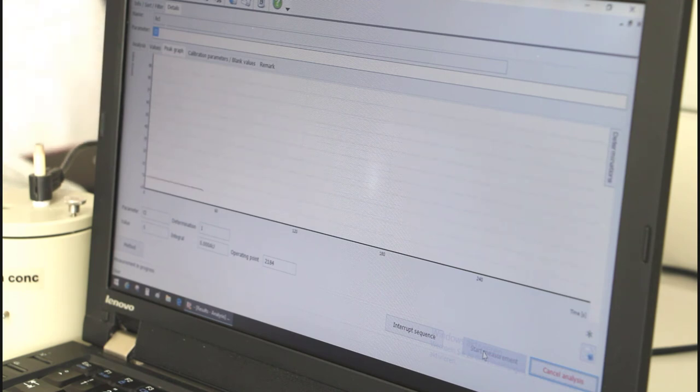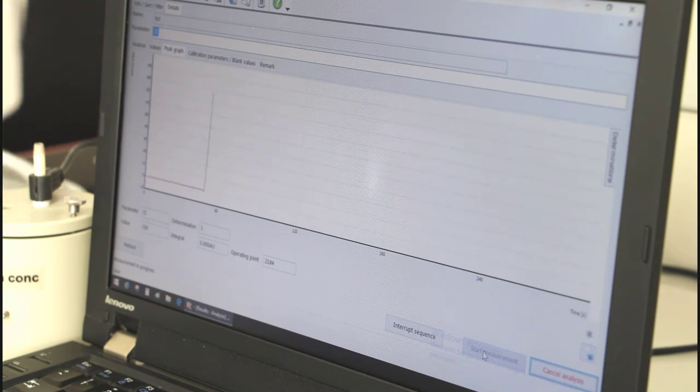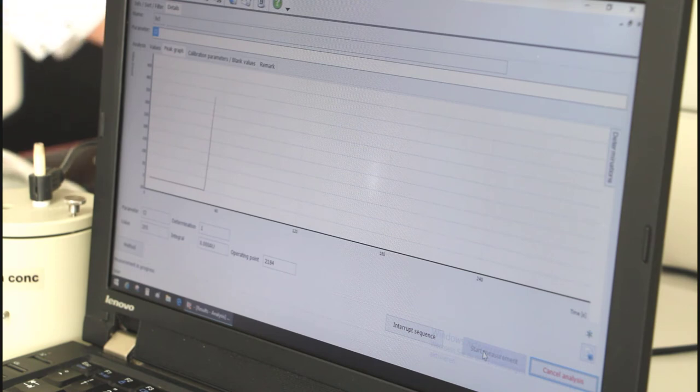Due to the nature of the coulometry as an absolute method, no calibration has to be applied. The measured detector value is directly related to the chlorine content.